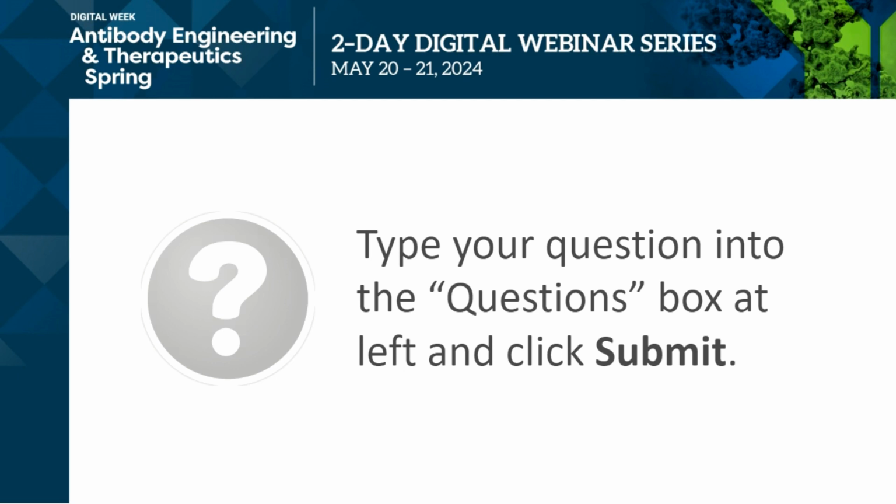Great, thank you for answering that. Can you explain how blocking might affect the Gator binding data? The blocking should not affect the Gator binding data. The reason is, first of all, in Gator, we don't need to block.